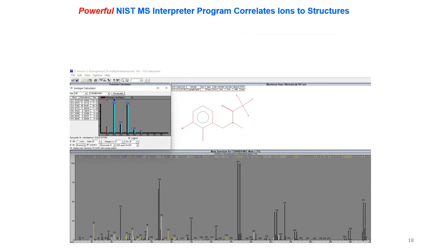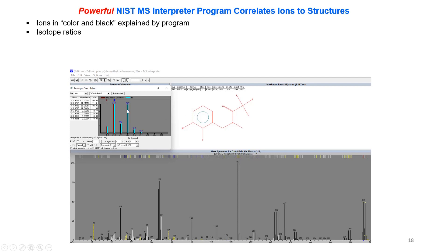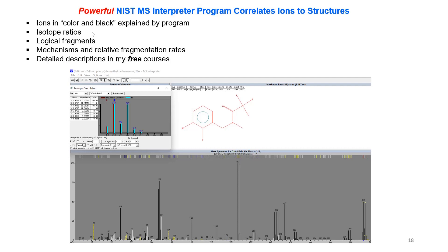Another powerful tool is the NIST Mass Spec Interpreter program, which correlates ions to structures. When we put our unknown spectrum into the NIST MS Interpreter search, almost everything is explained — ions in color and black are explained by the program, while white ions are unaccounted for, and yellow ions are due to rearrangements. Isotope ratios are shown for the molecular ion, comparing the modeled and observed values — when they match closely it gives great confidence in the identification. The program also shows logical fragments, mechanisms, and relative fragmentation rates. A detailed description of how to use MS Interpreter is available in one of my free courses.